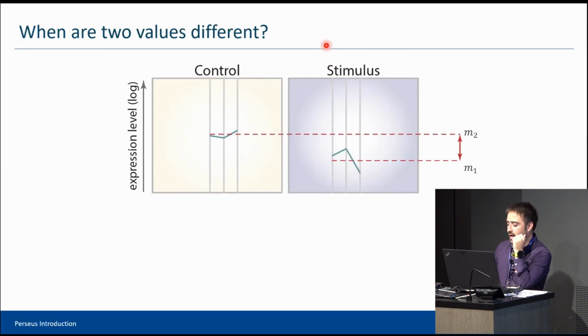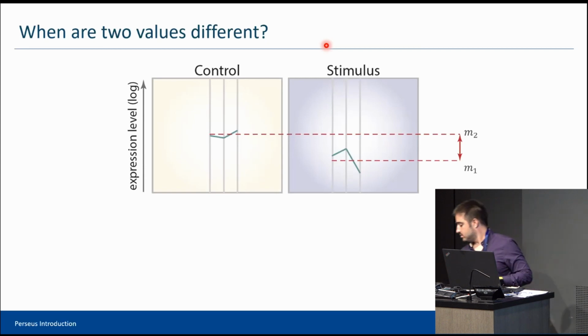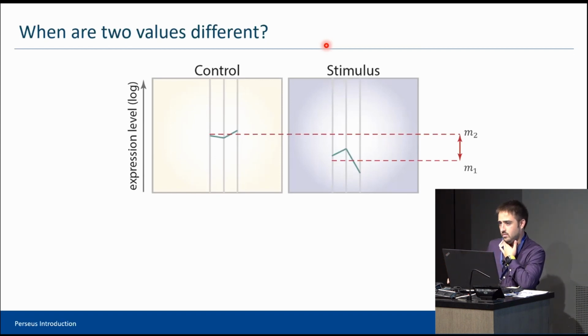They're already annotated. Yeah, so normally we pull the annotations from, I will show you later. We actually provide the annotations. So I don't know, Jürgen, maybe you know, if one really wants to add new annotations, how should one do it? I think we probably see better later when you show it live. And you can also use your own annotations. They are read into Perseus from text files. And as Juan says, we provide these text files, but you could also edit or change these text files that are storing the annotation. So you could use other annotation as well.